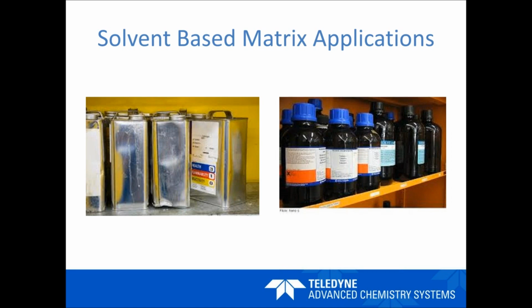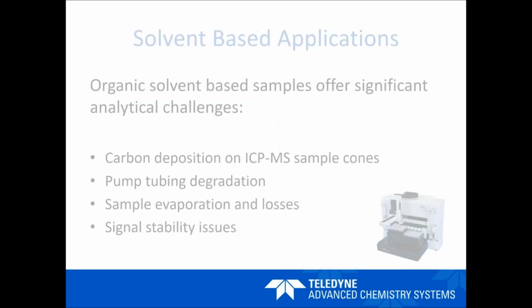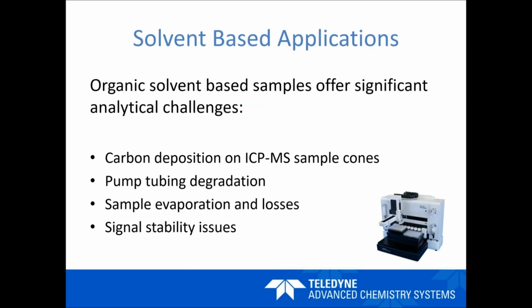So we've actually been exploring a very wide range of applications. We've gone from our clinical and biological, we've moved into the geological world. We've also seen very good benefits in working with organic-based solvents and petrochemical work. So this is the next bit I'm going to go into. I've mentioned before the potential benefits of working with low volume, low flow rate in terms of organic solvents, and essentially this is a summary of that.